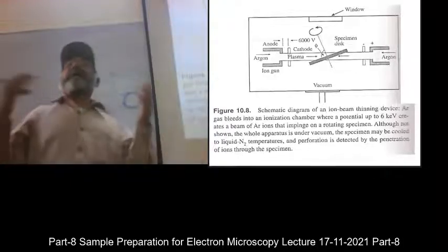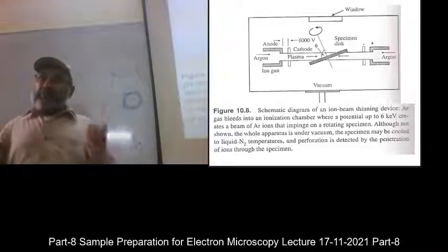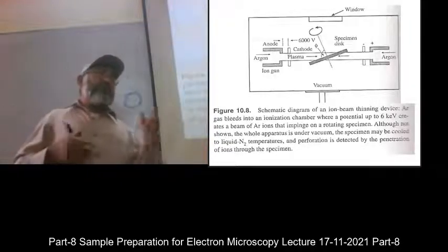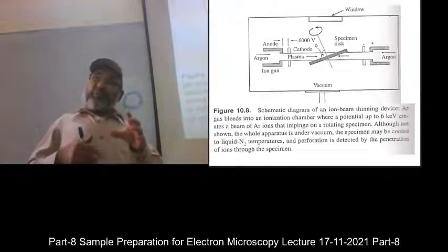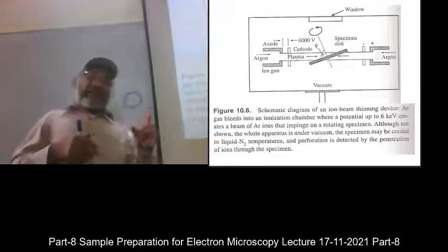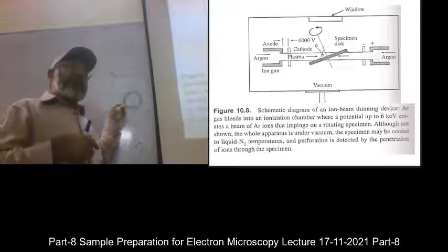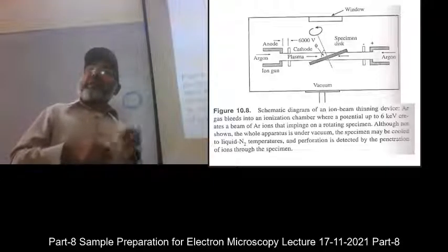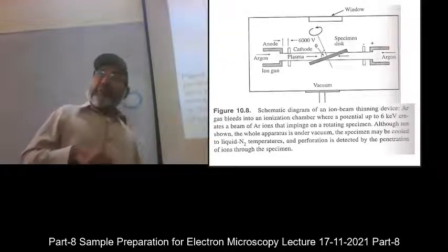But all the electron microscopes are kept cool using liquid nitrogen. But if the sample is also risky, then they have a sample holder as well to circulate liquid nitrogen here and avoid the damage due to a transformation due to heat.